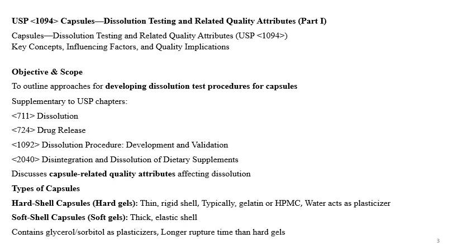Capsules are oral formulations, or you can say solid oral formulations, containing granules, powder, or pellets. Nowadays these capsules may also contain liquid, a pellet and powder combination, and may contain different combinations of medicines. Mainly this chapter is related to the capsule formulation.